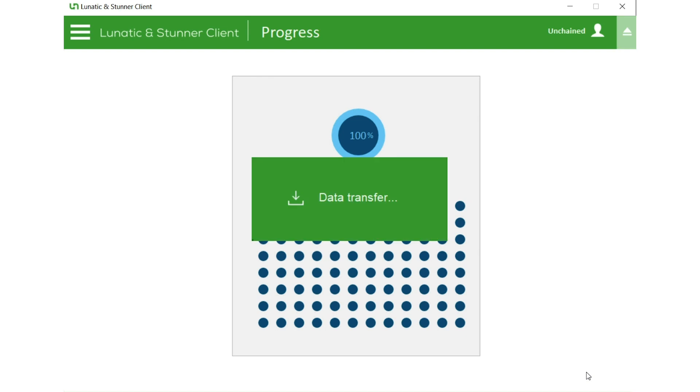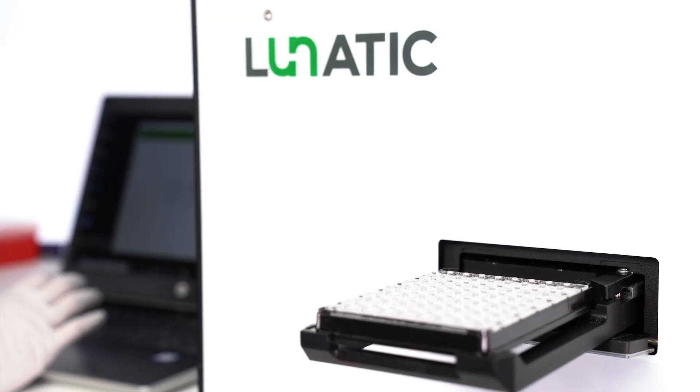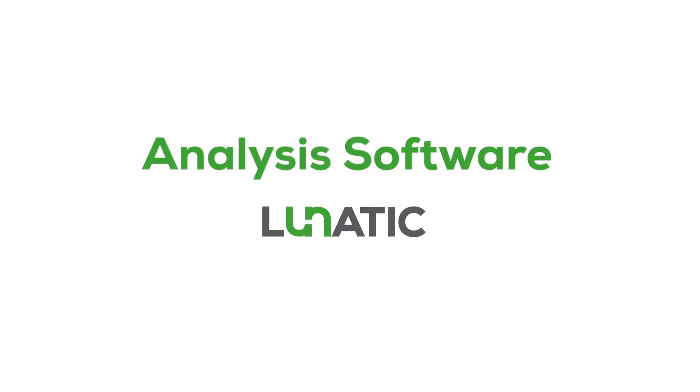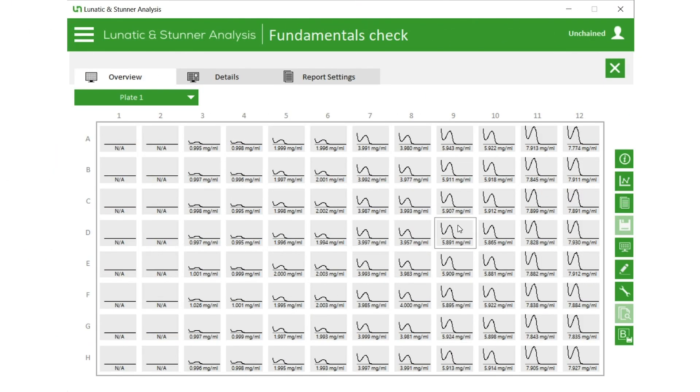And we're done. Let's take a look at the analysis. The analysis software shows you all 96 UV-Vis spectra and calculated concentrations all at once.